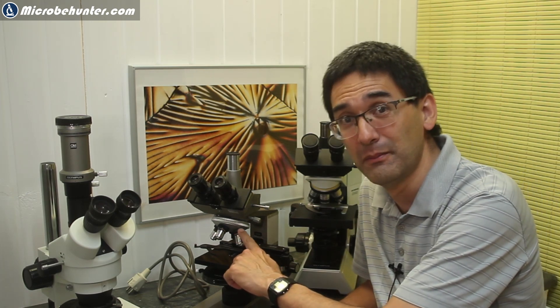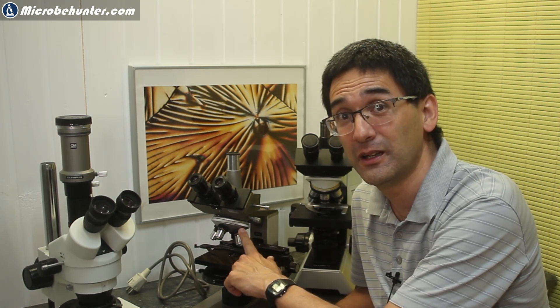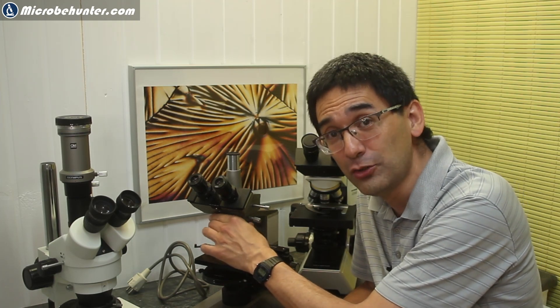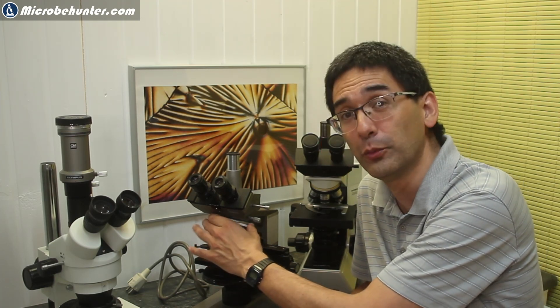If you exchange your microscope objectives, however, I do recommend that you exchange all of them at the same time. The reason is, if you have a microscope objective of a different series, then when you change the magnification and rotate the different objective into position, it might not be par focal. That means you have to refocus it. And especially for the high magnification objectives, this can be quite annoying. So my recommendation is, if you change the objectives, change all of them unless you have good practice in using the microscopes.